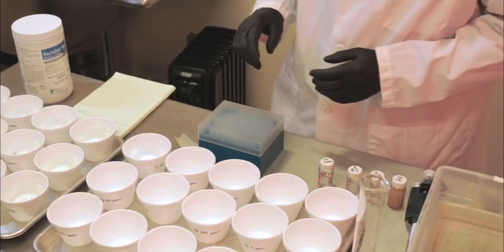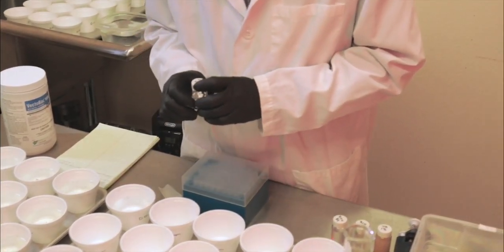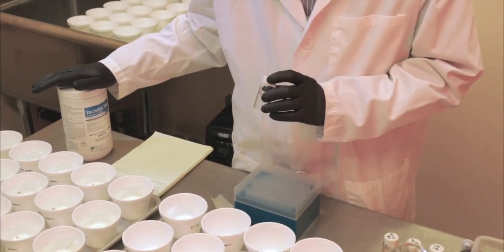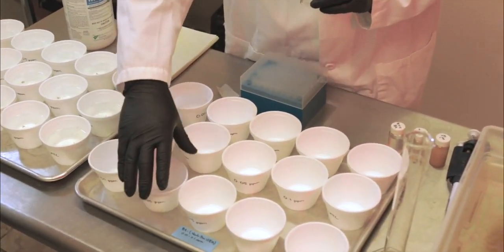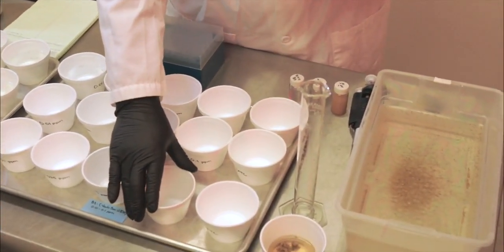So the calculation is we need to add, from this 0.001% 3000 ITU per milligram BTI, an amount of 100 microliters, 250 microliters, 500 microliters, and 1000 microliters or 1 milliliter.